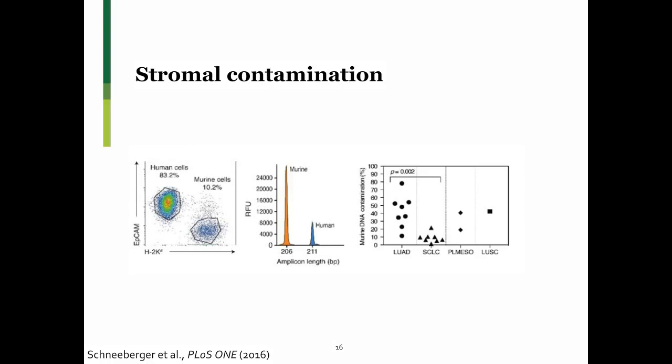This let us do a couple of things. One is it let us enumerate the number of cells that belong to each class, but it also gave us the potential to use flow cytometry to sort these two populations and obtain pure reference populations of either one.